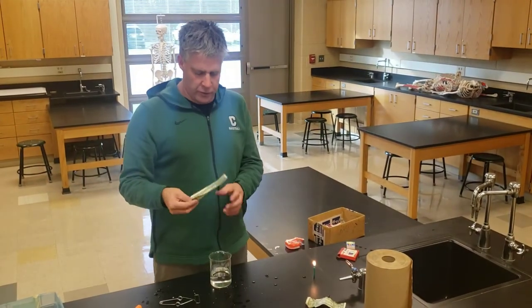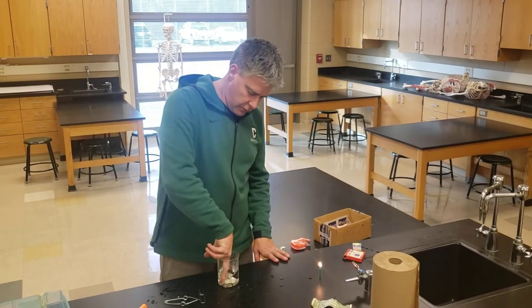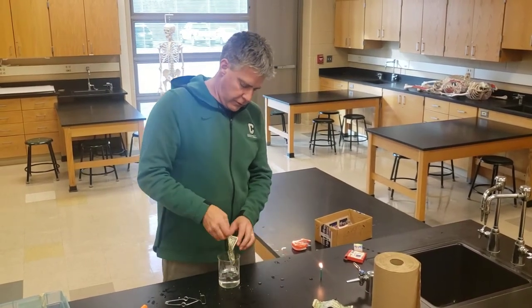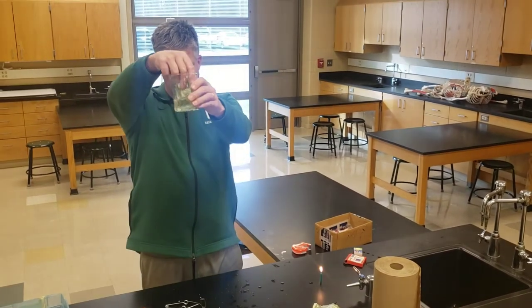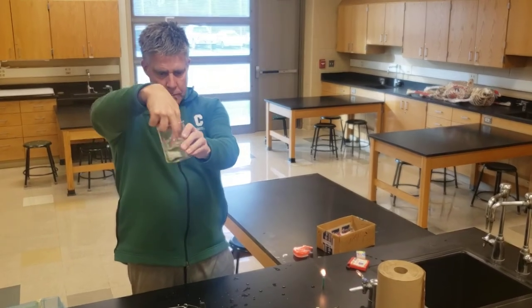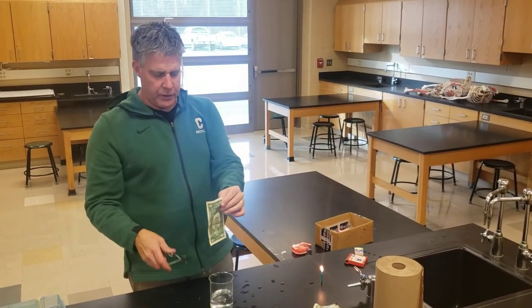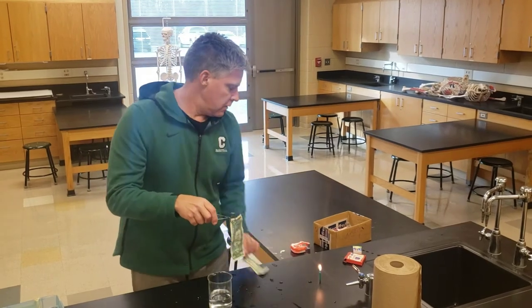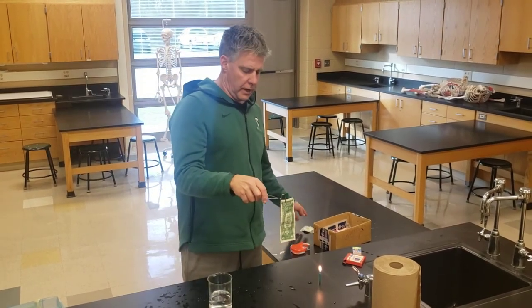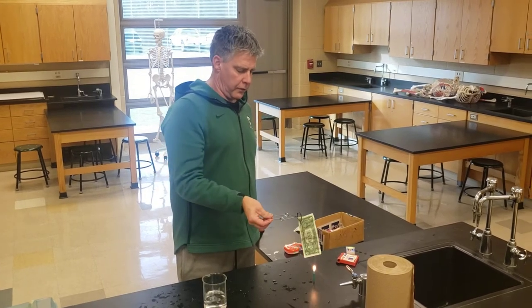All right everybody, I'm going to show you the dollar bill demo. I'm going to take the dollar bill and dunk it in this beaker of clear liquid. Get it nice and wet — it's very, very wet. Normally I do this with one of your dollar bills, but today I'm going to do it with my own because you're not here.